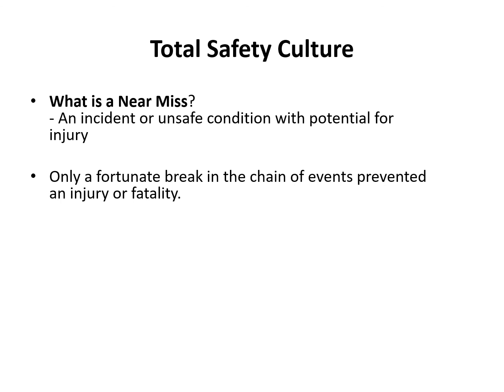So this is a very short lecture about the biosafety levels, and I hope you now have an idea of how different microorganisms or biopathogens are treated in different labs according to their severity. In Oman, we don't have BSL 4 labs, we have only BSL 3 labs, and at our university, mostly undergrad students work in BSL 1 or maximum BSL 2 labs.